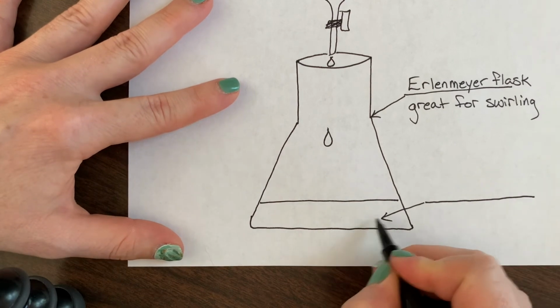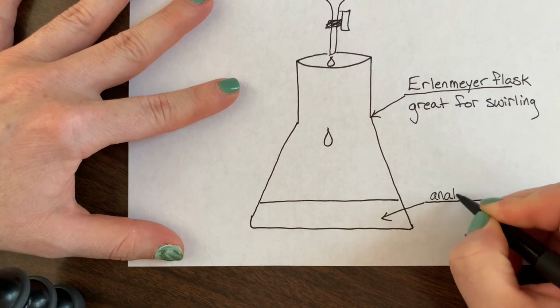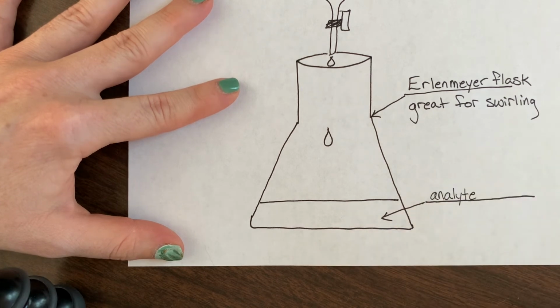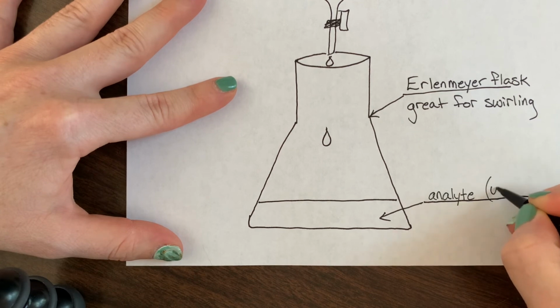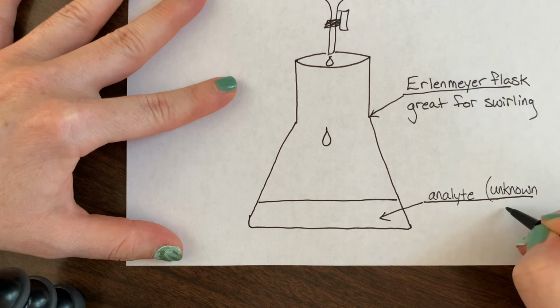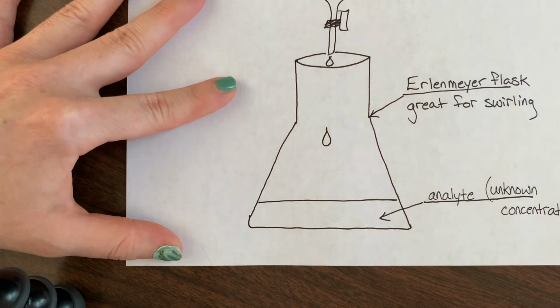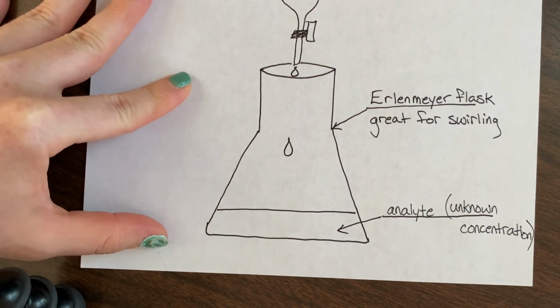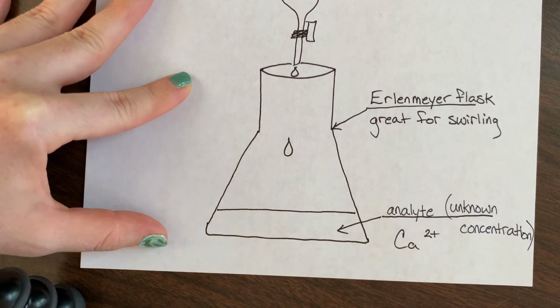Right, and last but not least, we have our analyte, which is an unknown concentration. Ooh, that ran out of room there. And that is going to be your calcium in your water sample.